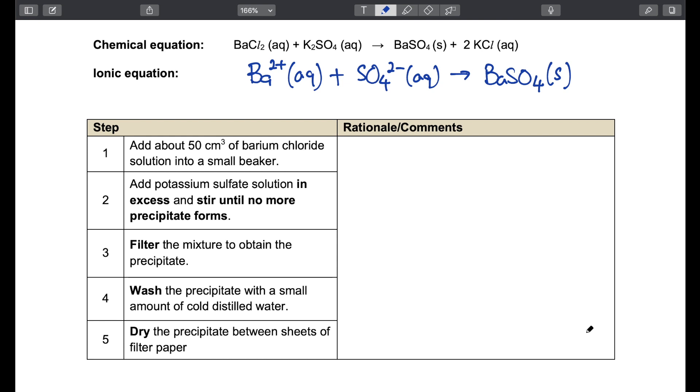Now we go over the procedure of how to carry out precipitation reaction. We start by adding about 50 cm³ of barium chloride solution into a small beaker. This volume doesn't really matter. We will mix our second solution in, in excess, and stir until no more precipitate form. This is to ensure all the barium chloride is reacted. It doesn't matter which one we add to which, we can reverse the order. It's perfectly okay.